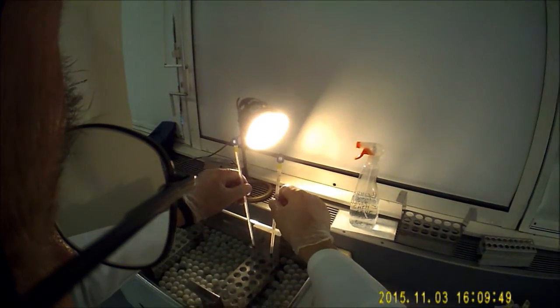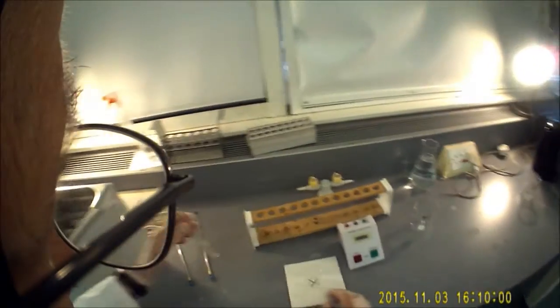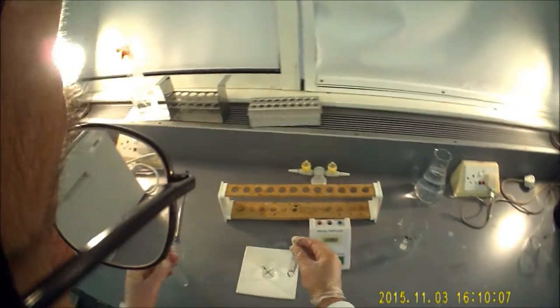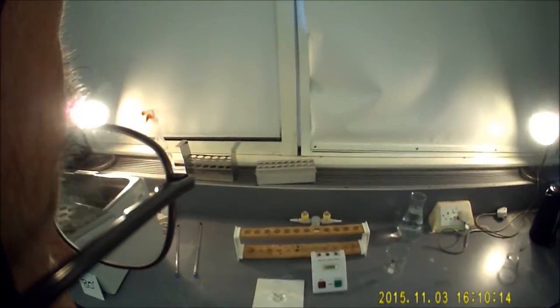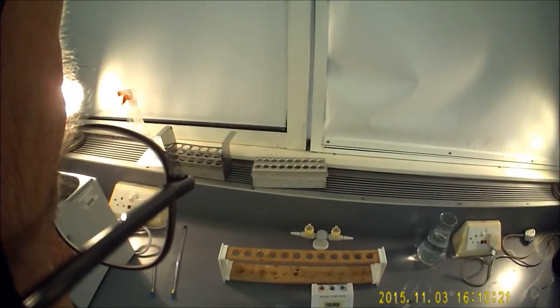I've just checked and both of the test tubes' contents are now at 80 degrees. Don't worry too much if it's a degree under or a degree over — it's the comparison you're looking at. Then you're going to pour your sodium thiosulfate into the beaker over the cross, pour in the hydrochloric acid, start the timer, and wait for the sulphur to be precipitated out and for the cross to actually disappear, exactly as you did before.